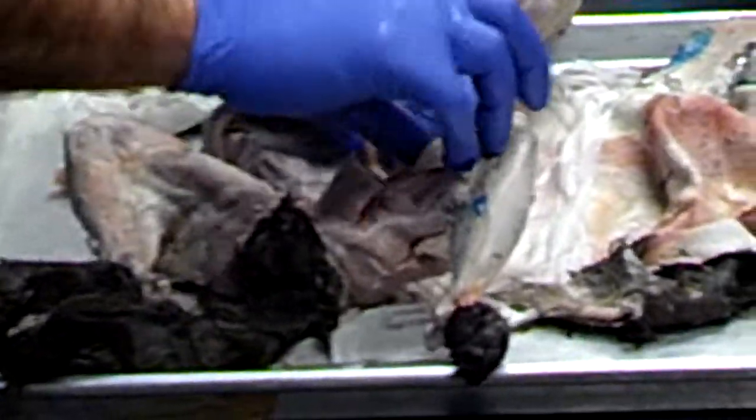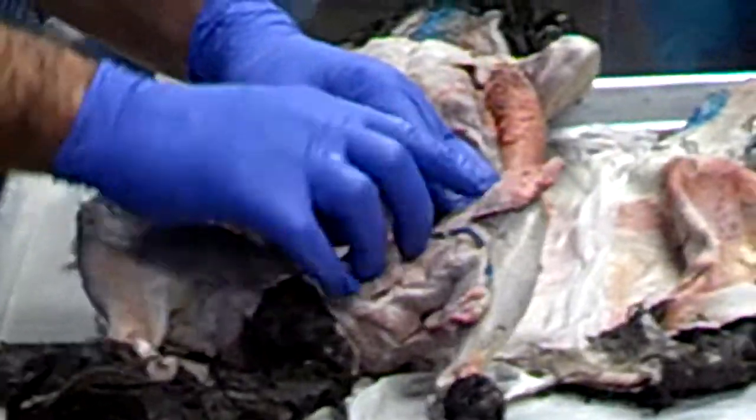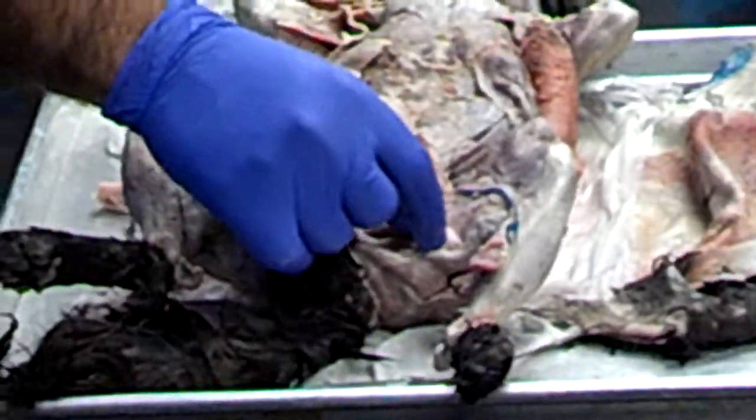Separate them. Then, when you cut the sartorius, underneath is your quadriceps femoris, which has four parts: vastus lateralis, vastus medialis, and right in the center is rectus femoris. Rectus femoris is the shiny one. Rectus means straight, so it is sandwiched between the lateral and medial parts. And outside here, this part, which is half fascia and half muscle, is tensor fascia lata. If I reflect the gracilis down here, you can see adductor longus, adductor femoris, semimembranosus and semitendinosus. You guys are okay up to this point?